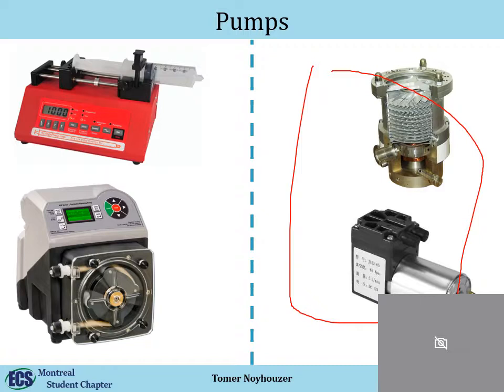The problem with those is that if you get some sort of contamination or some salt is deposited here on the blades, then the pump is destroyed really fast, and trust me, I did destroy one of them because I had some salty water spill on it. So they're very accurate, but they're also very expensive. But if you're using small volumes, you have to use those.